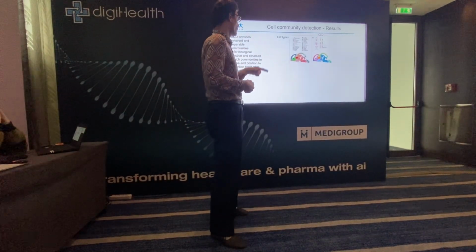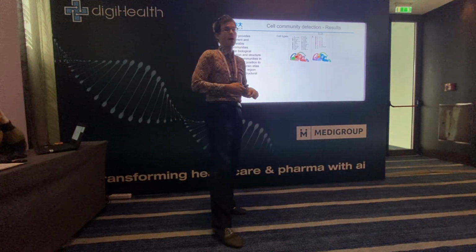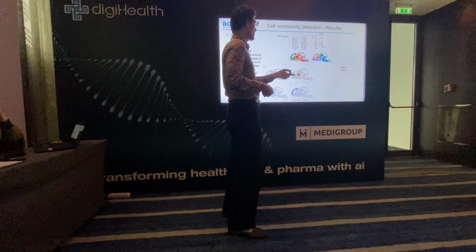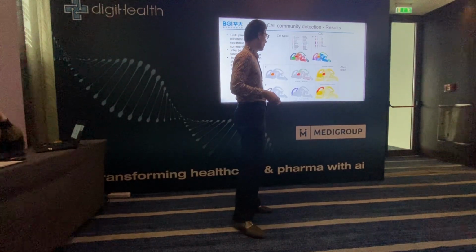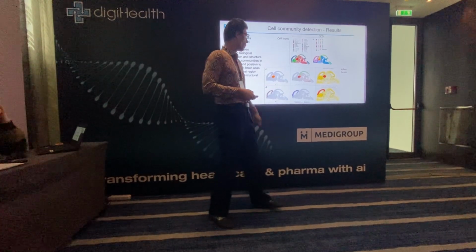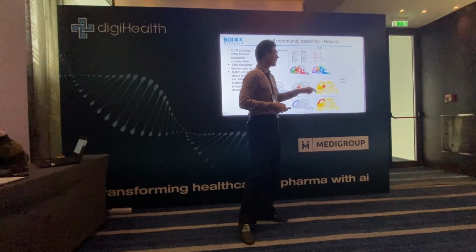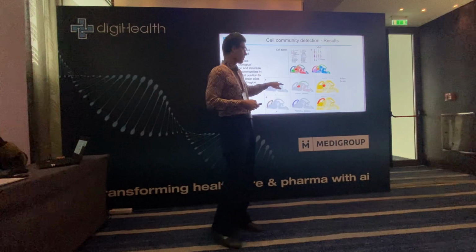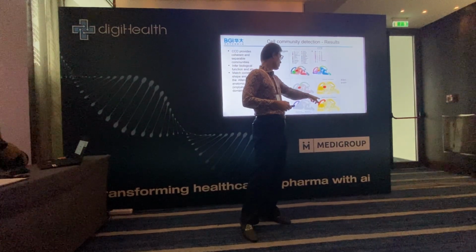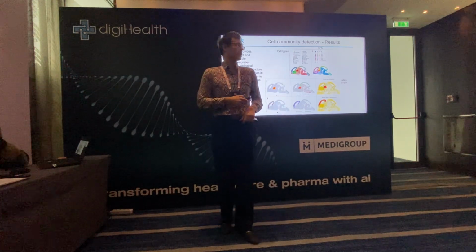So for this very well explored tissue of the mouse embryo brain from day 16, we looked at existing databases such as Allen's brain atlas, and we found matches for this central orange community. We matched it with the dorsal thalamus in this brain atlas. The brown community matches with the mantle zone of the dorsal pallium.